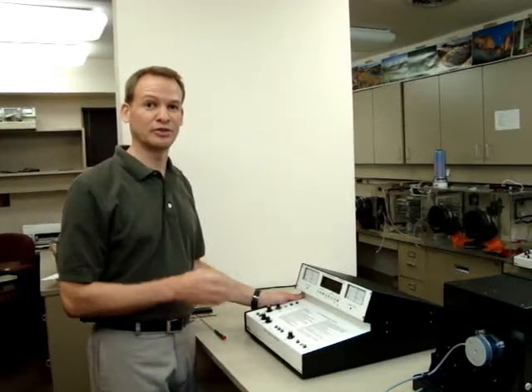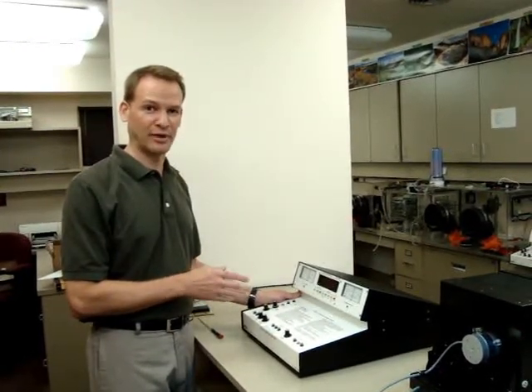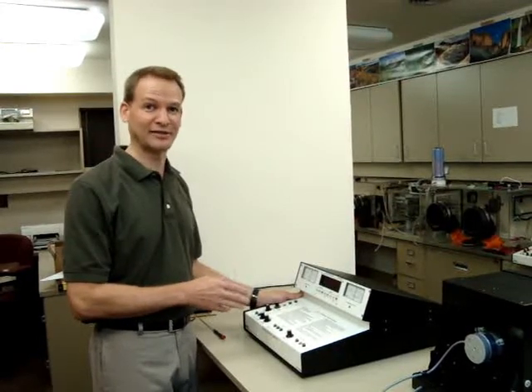This video demonstrates how to set up and operate the 406D static decay meter.